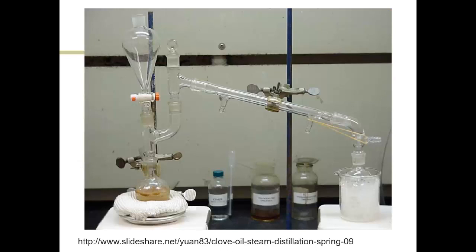So this in reality is what it looks like. Again, this is sealed like I mentioned before. Your liquid is in here, and you can't see it, but your little cloves are in there, and the liquid will start turning kind of brown. You're going to put your thermometer on this side, and then you're going to have your distillate go on the other side. Now, once your distillate goes on this side, remember it needs to be in an ice bath so that it can collect easily.